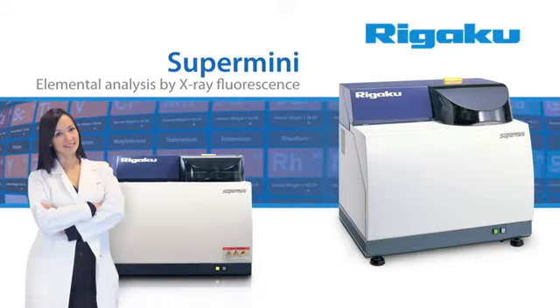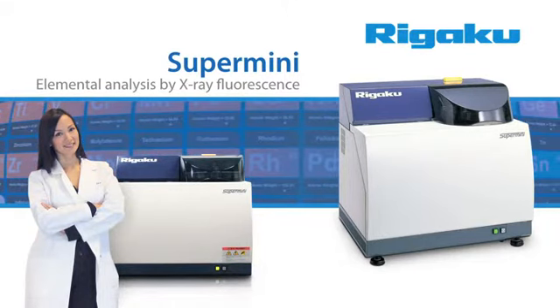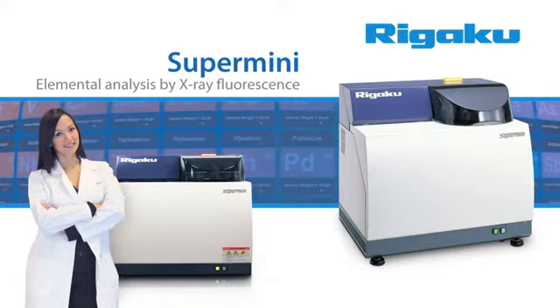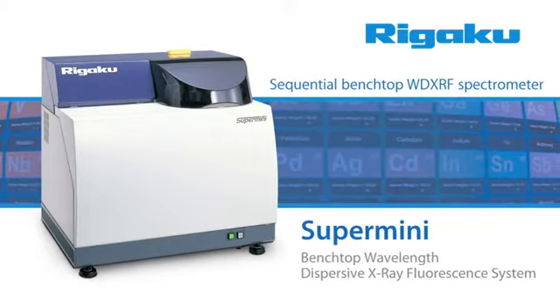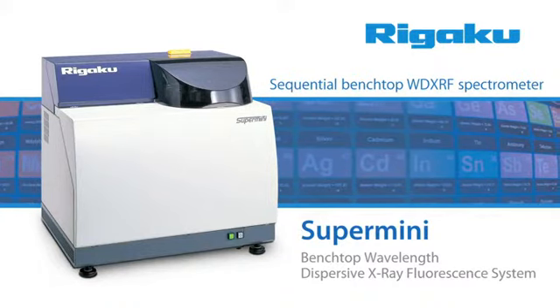Imagine having the analytical power and performance of Wavelength Dispersive XRF available at a fraction of the total cost of ownership of a conventional mainframe X-ray fluorescence system. Well, now you can with Rigaku Supermini, the low-cost Benchtop Wavelength Dispersive X-ray Fluorescence System.